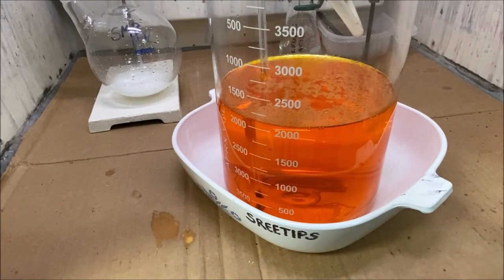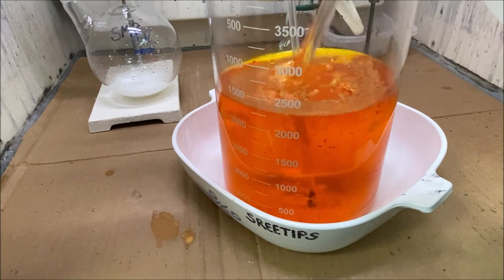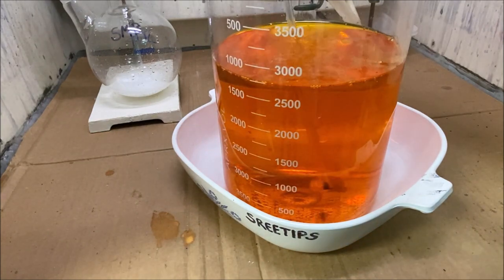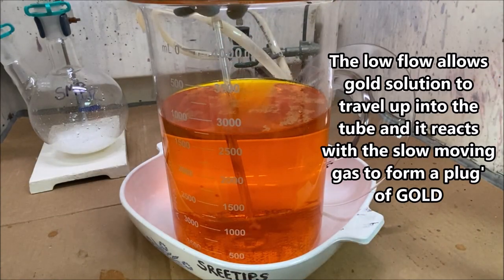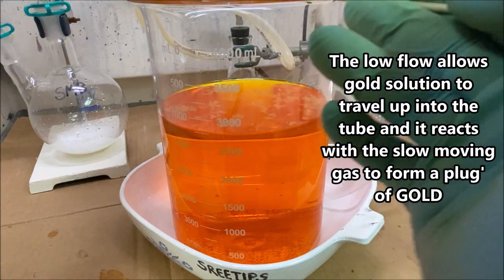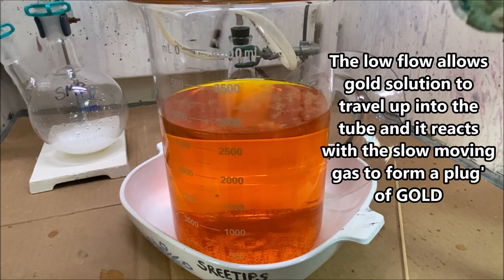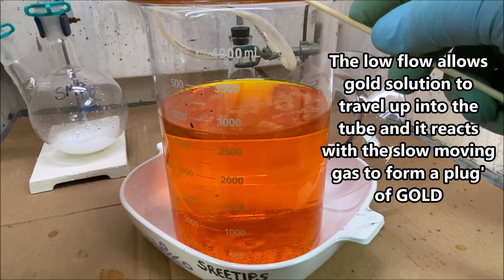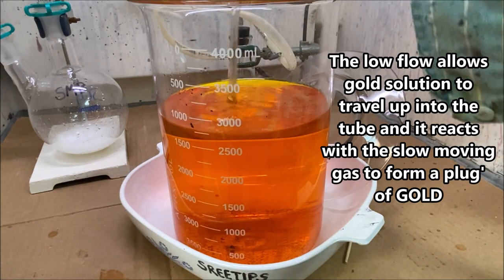Okay, we're about 5 minutes into the reaction here, and I may have this solution still too concentrated, so I'm adding some distilled water. Get the tube off the bottom of the container. Yeah, it's got a plug of gold in it, of course. Plugged up with gold. There we go. Got it loose.